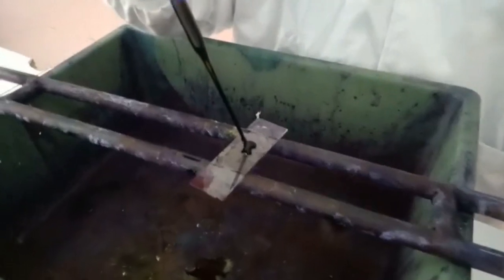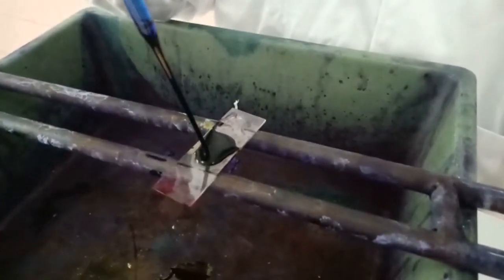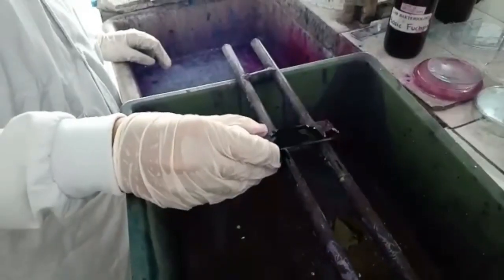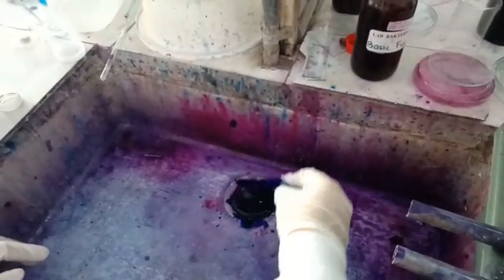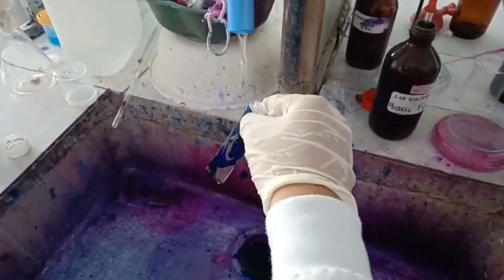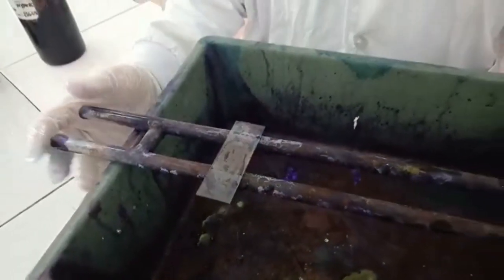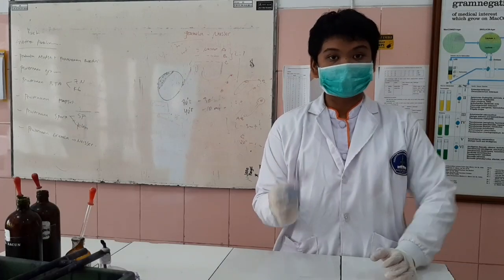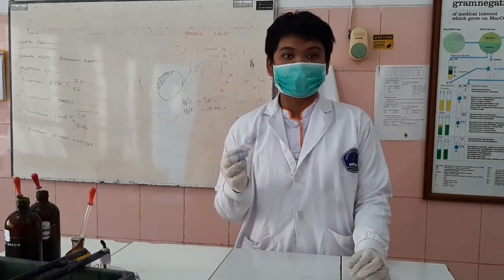Drop the methylene blue until the slide is inundated. Wait for 1 to 2 minutes. Throw away the methylene blue and wash it with clean water. After washing it, wait until the slide is dry. After the slide is dry, we can use this preparation for observation.